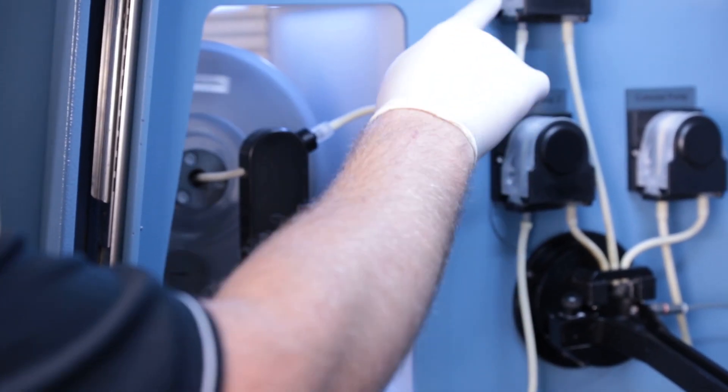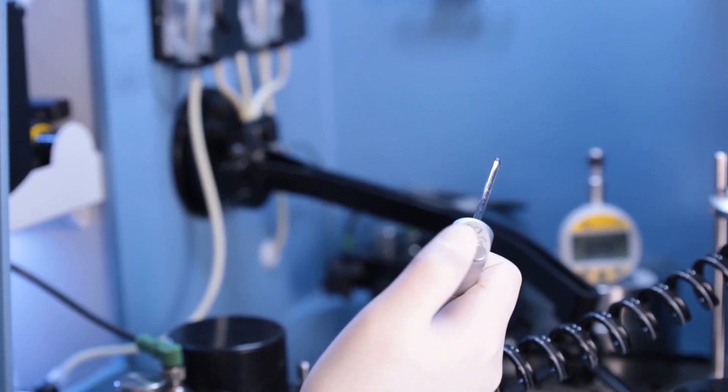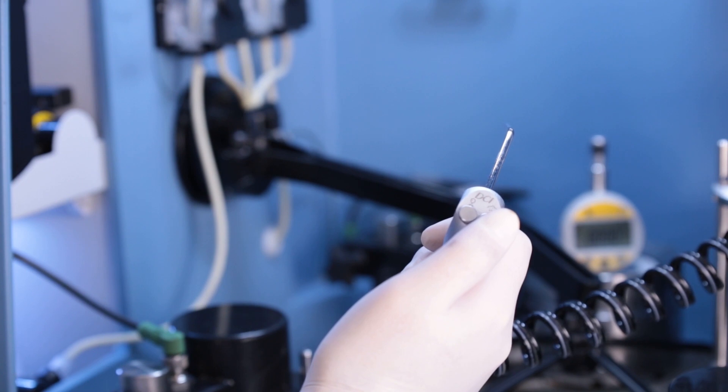Slurry delivery is accurately delivered by the touchscreen control of peristaltic pumps. There's also an inbuilt air and water cleaning gun for both the samples and the jigs after each process.